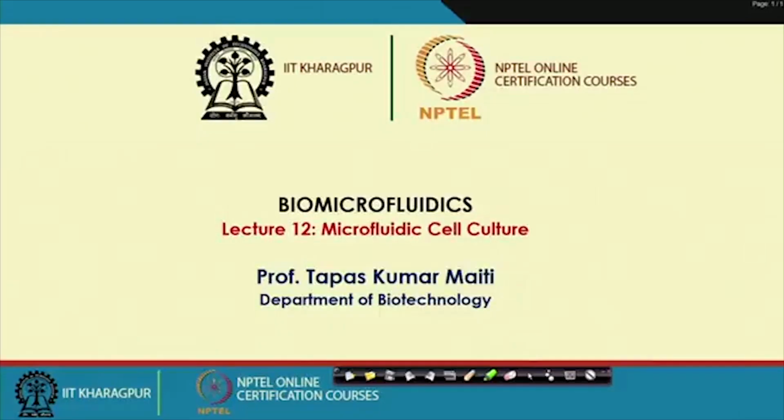Now, we are discussing how cell culture can be done in that microfluidic platform with different modalities and with some precautions. Then we are comparing how microfluidic cell culture differs from macro scale and what the challenges are in microfluidic cell culture.